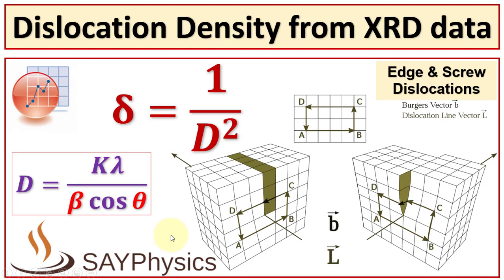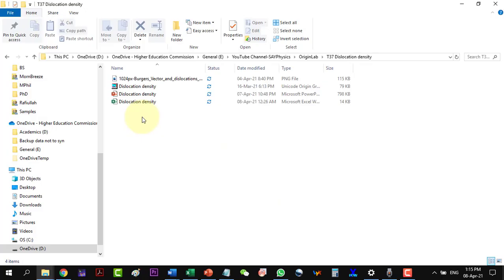From Origin, we will find the values of full width at half maximum, which is beta, and the Bragg's angle theta. To find the values of beta and theta, let me start with the Origin file.